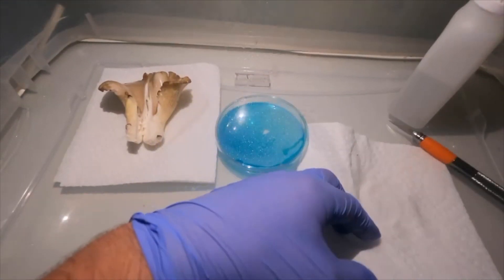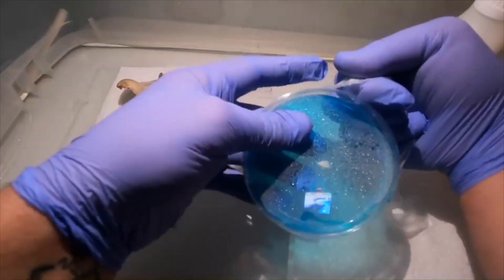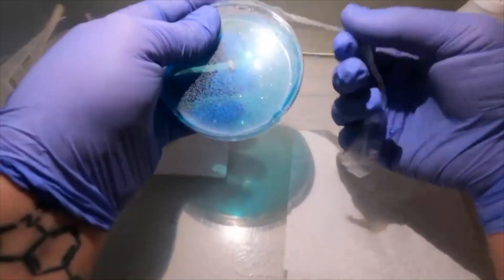If your agar dish does become contaminated, you can isolate the healthy part of it onto a new agar dish, which I'll show you at the end of the video.